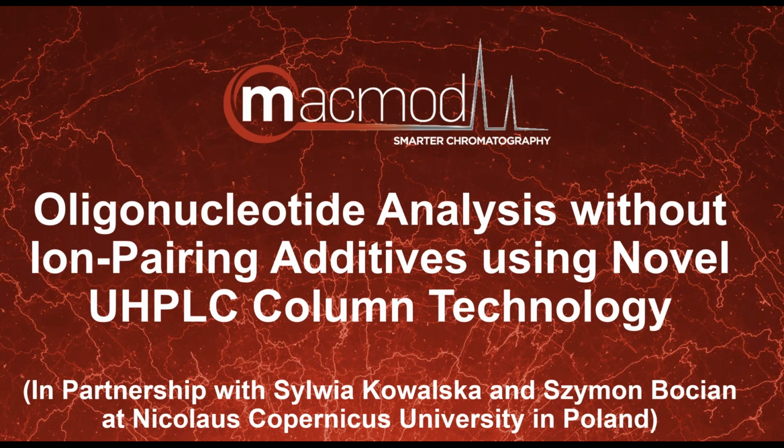Thanks, Alex. Super excited to be here today. This webinar, part 3 in the series, is entitled Oligonucleotide Analysis without ion pairing additives using the novel UHPLC column technology. We partnered with Dr. Kowalska and Dr. Bocian at Nicolaus Copernicus University in Poland to generate this data. And it's been an excellent partnership, and we have a bunch of future work that we're working on.